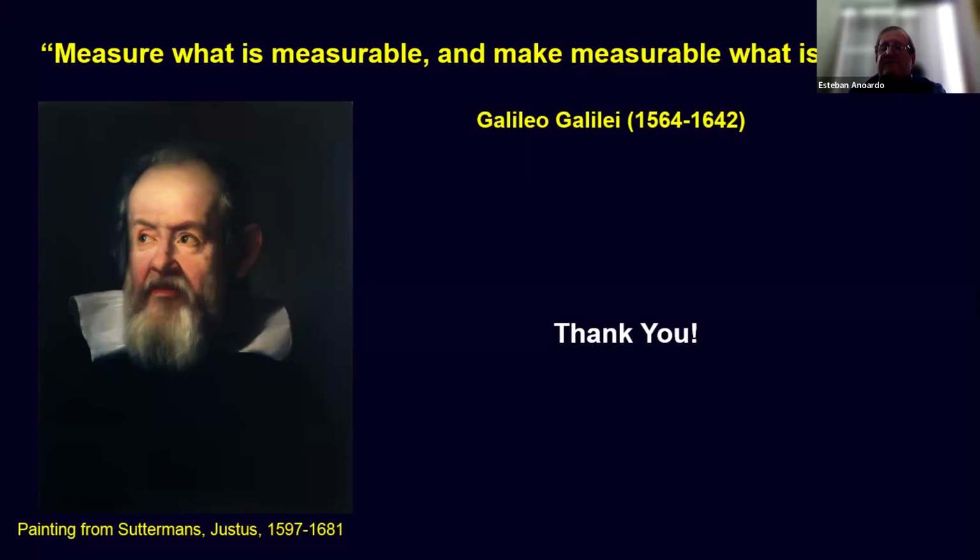The only way, I'm sorry, but the only way to know that the parameter you get from field cycling is okay is that you measure that parameter with another technique and you get a similar result.